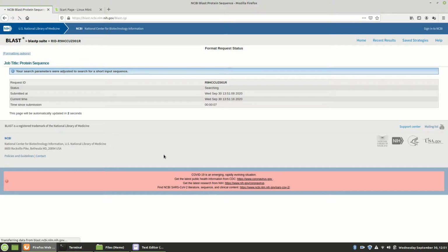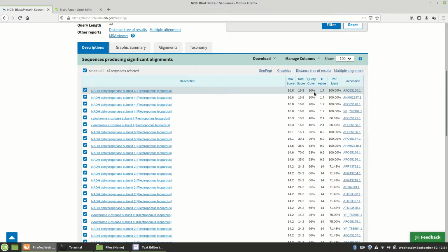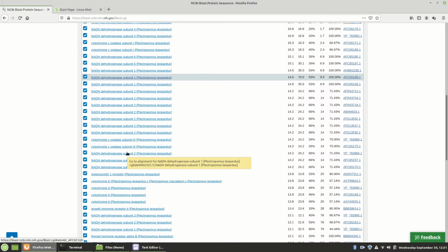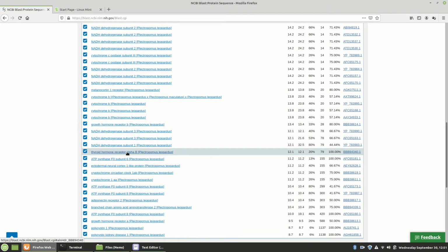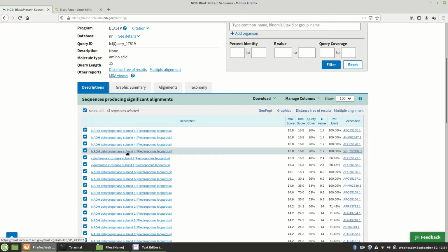And it is searching. And we got something. All right, now it's not great. 1.7 is not a good e-value, but it found NADH dehydrogenase, and that is a similar protein. You wouldn't know that, but that's what you could report if trout were the organism I gave you, and you would report that, hey, this actually has some similarities in structure to another enzyme called NADH dehydrogenase, and there may be some relationship between the two.